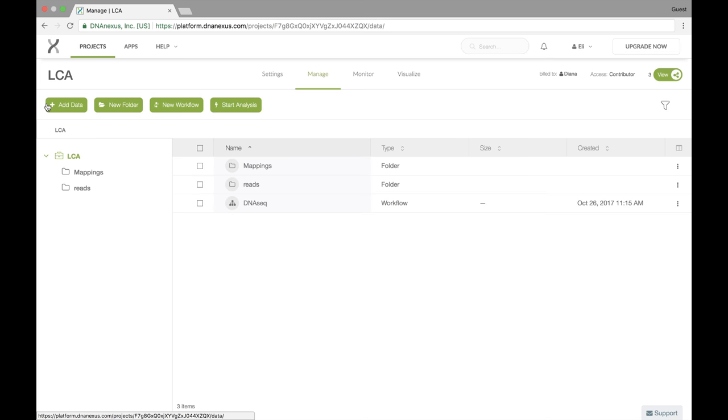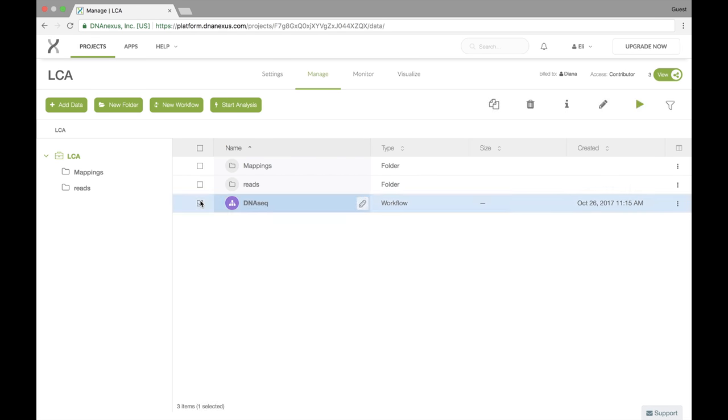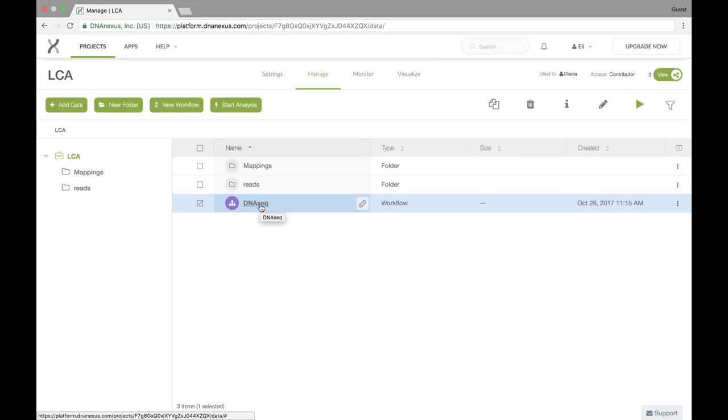For running your workflow, you have three options. You can choose to click start analysis and then search for your workflow, in this case DNA-seq. Or you can select the workflow and select the run icon. Or you can click the actual workflow.